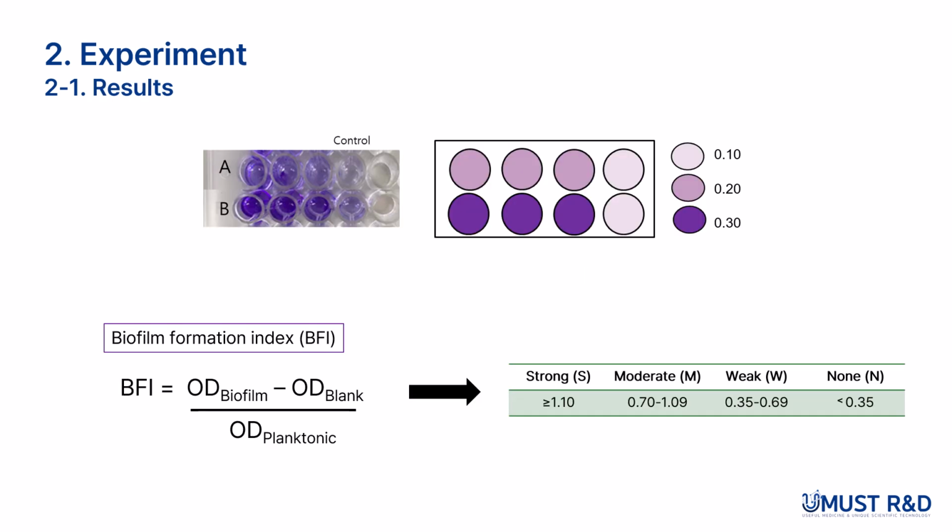As a result, we can calculate the BFI, biofilm formation index. So the formula is here. The table shows how we categorize the results based on the OD values.